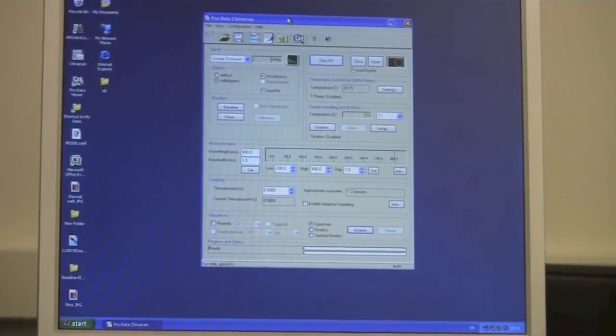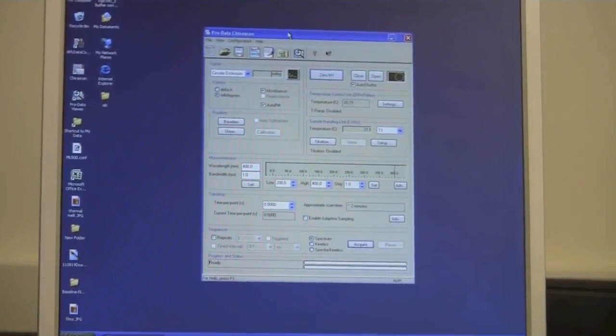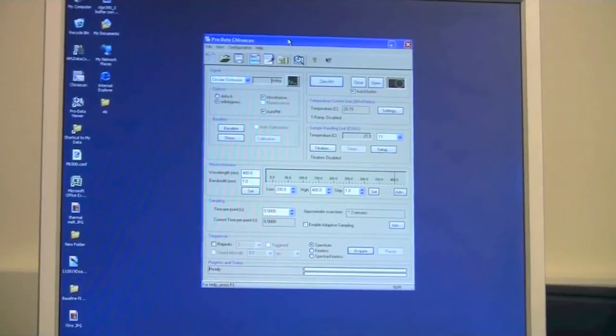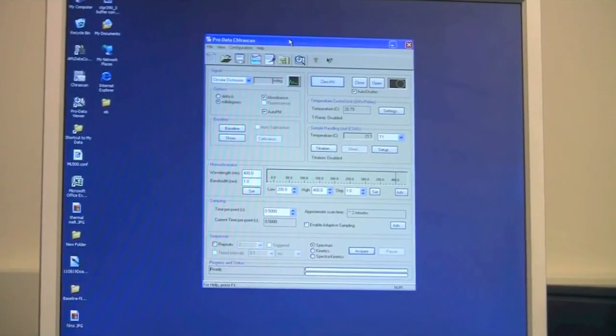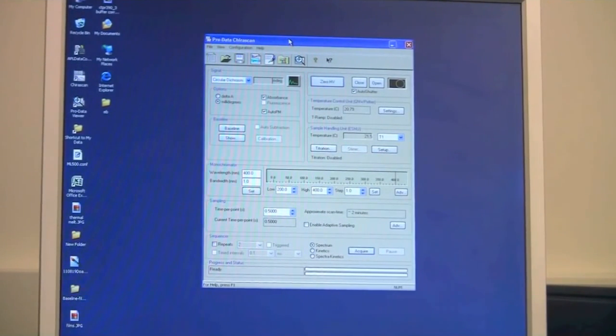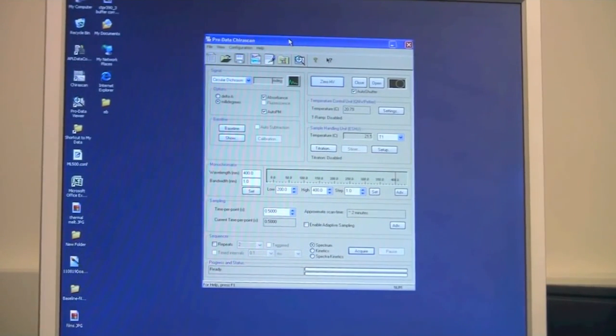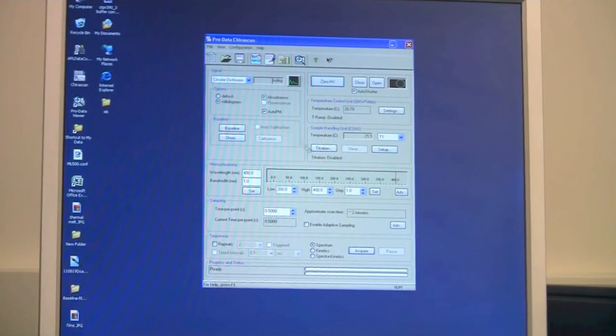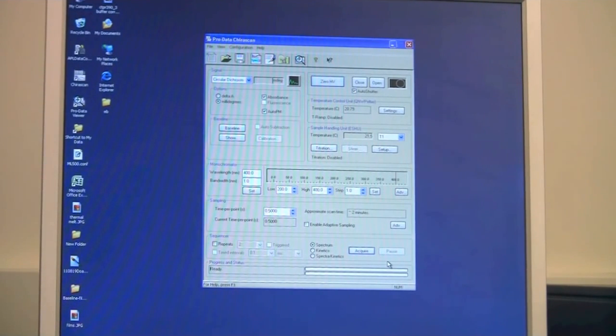This ChiraScan software is the control panel. This is where you will set up your experimental design. It's always a good idea to work from the top left down to the bottom right when you are setting up your design.